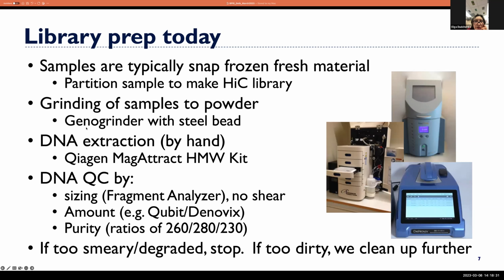Since you're going to talk about more smeary, I wanted to also talk about too dirty. How often do you have to do secondary cleanups? Because the kits are presumably doing some heavy lifting across a wide range. Some are organic. If you're using an organic extraction, often there's solvent carryover, right? So that's one type of dirty. If you're not using RNA clean, percent wise, how often in practice do you have to do secondary cleanups? I'm curious, from practice across the wide range. And there's range, other things too.